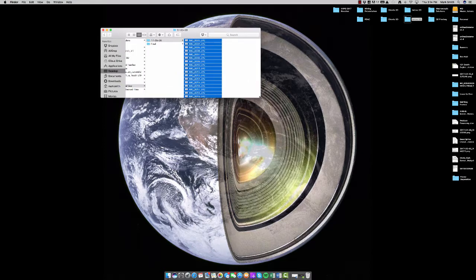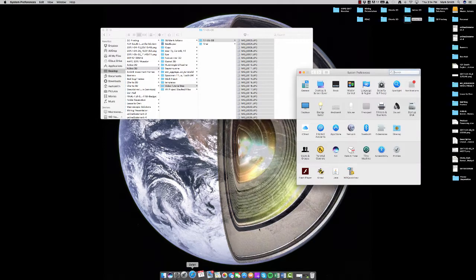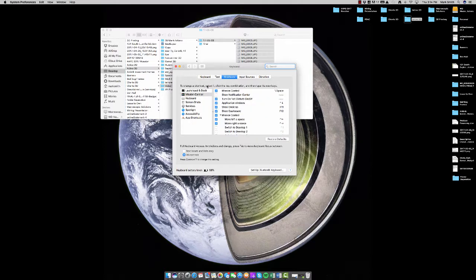Now, the first thing we have to do is actually navigate to this directory in terminal, and not all Macs are pre-configured to do that. So first we need to go into System Preferences and Settings, and then you want to go to the keyboard icon, so click on Keyboard, and then you want to go to your Shortcuts function, Services, and you want to scroll down until you see this. So Files and Folders, open that one, and then New Terminal at Folder. You want to check that.